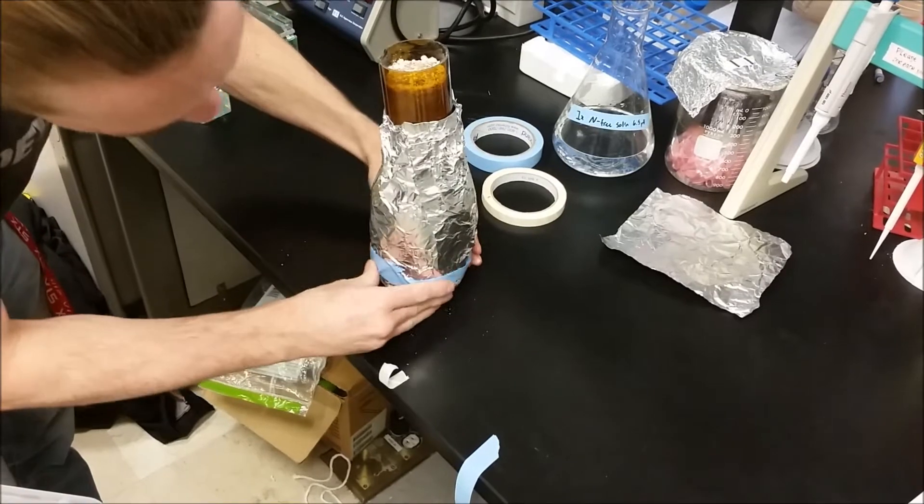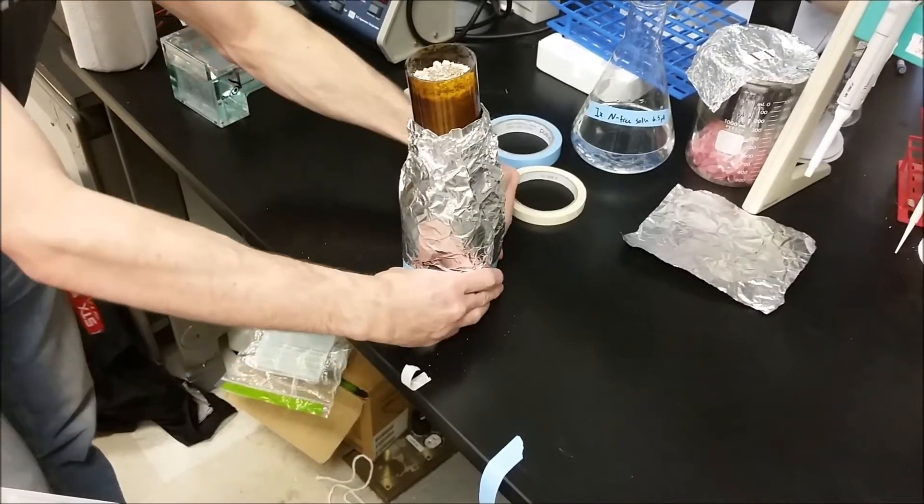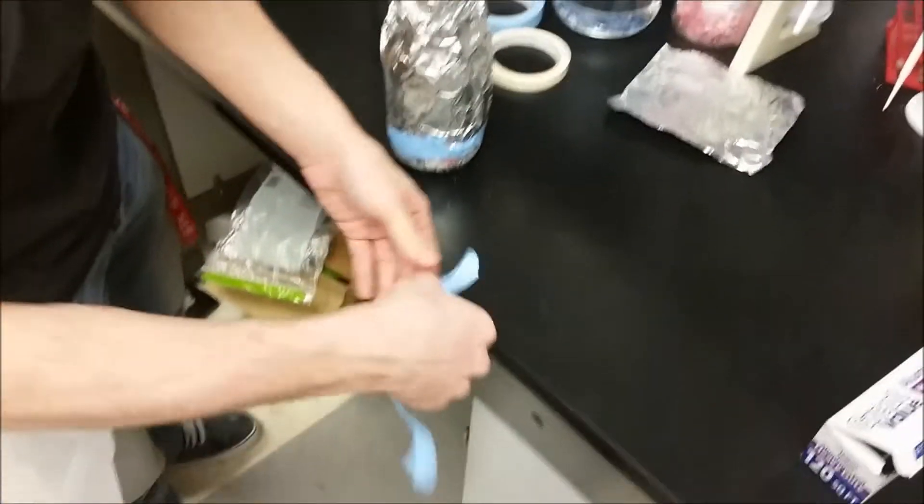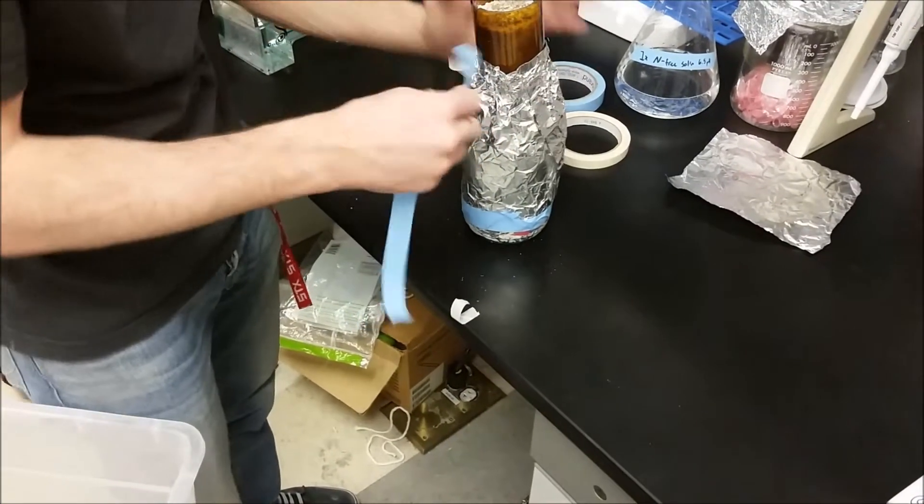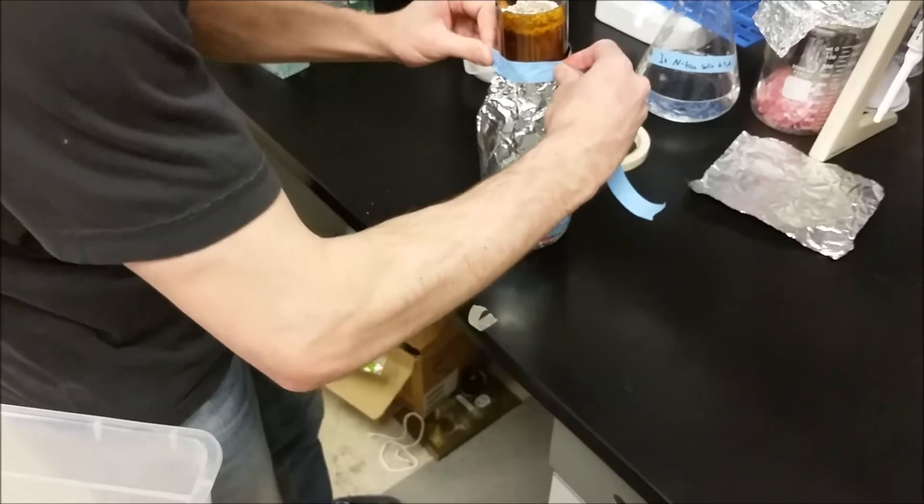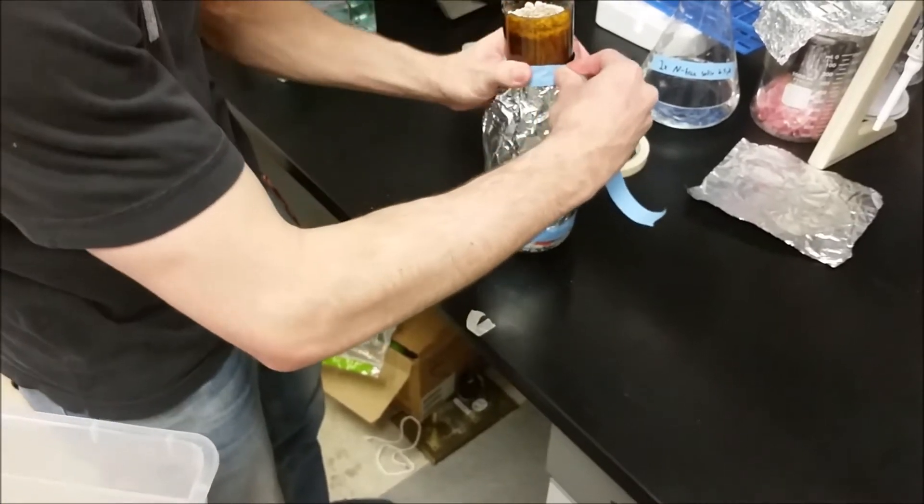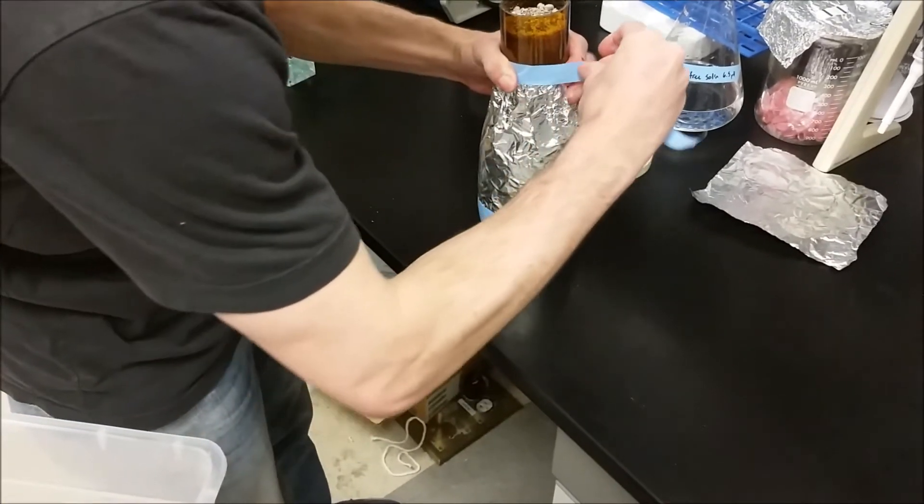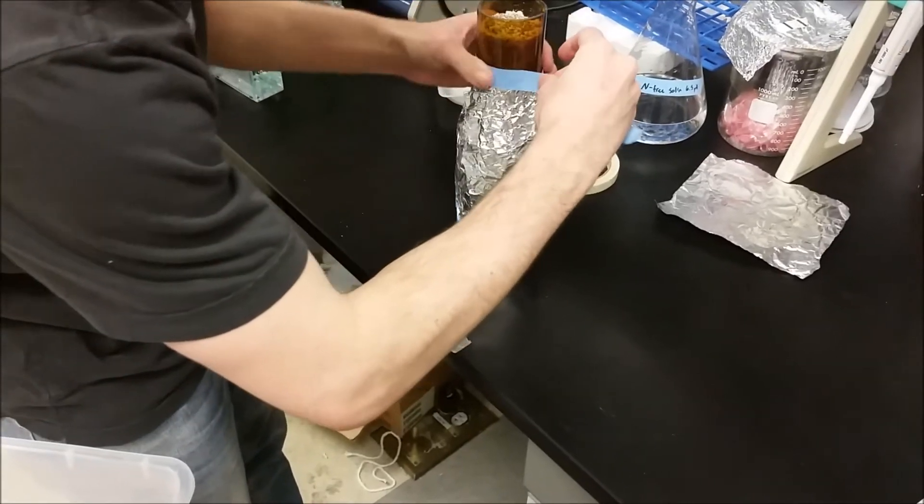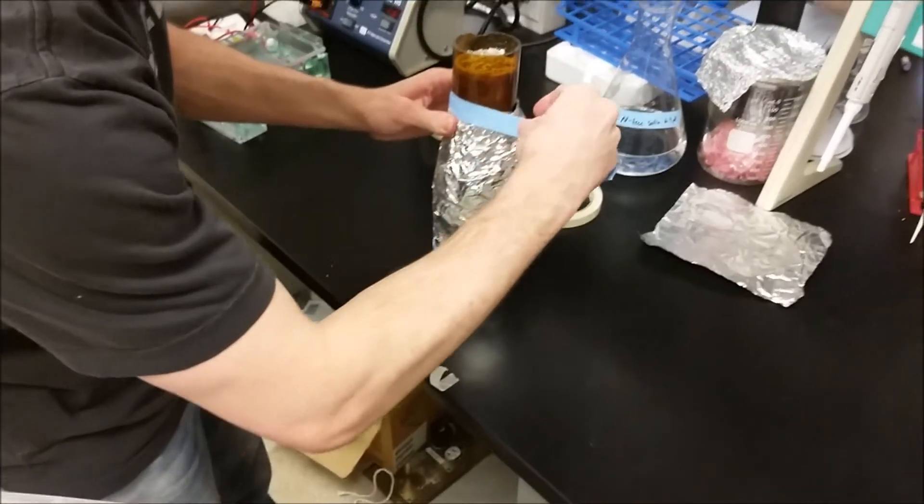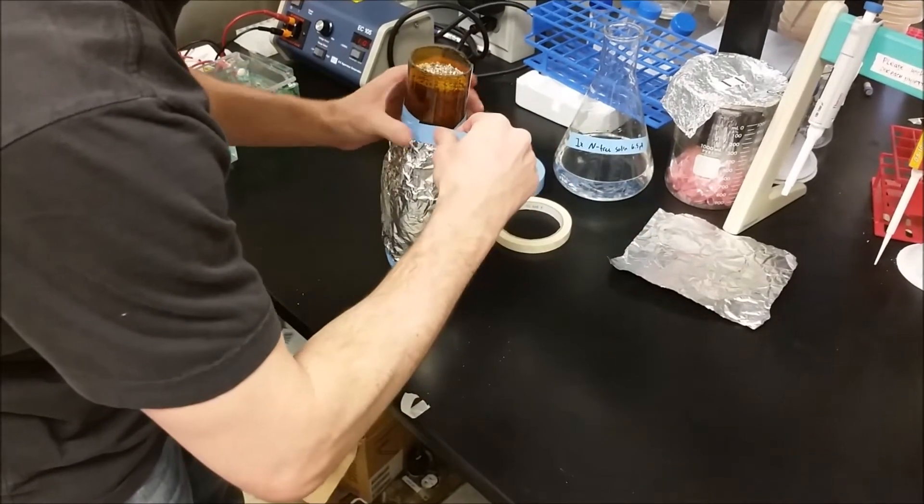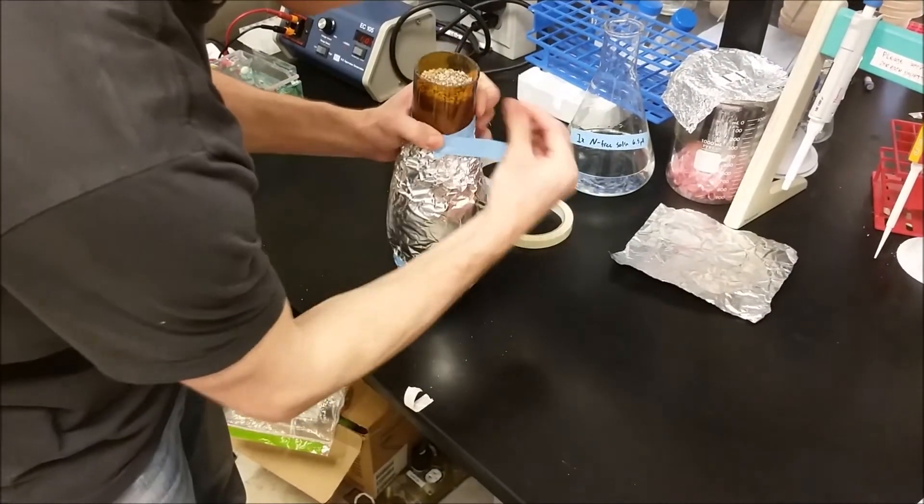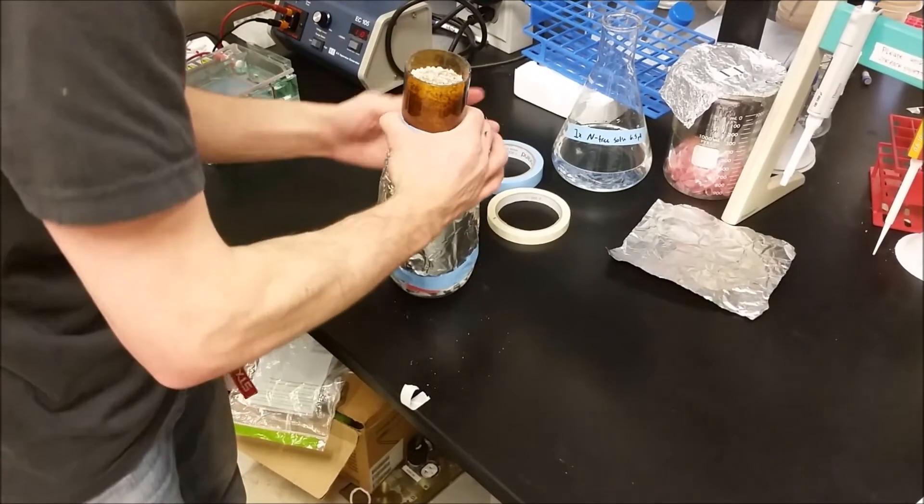So now there's nothing getting in or out of the bottom. Now I'm going to take a slightly shorter piece of tape and we're going to tape up the top, trying to make sure that there's no way that anything can get in or out through the foil. That should be fine.